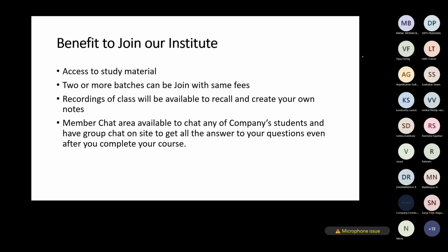So basically, we are covering the basic tools, like what static data is, maybe the modules, maybe the workflows, the basics of instruments. If you want to learn all those things in depth, it would be a 6 month to 1 year course, because you understand how complicated it is.